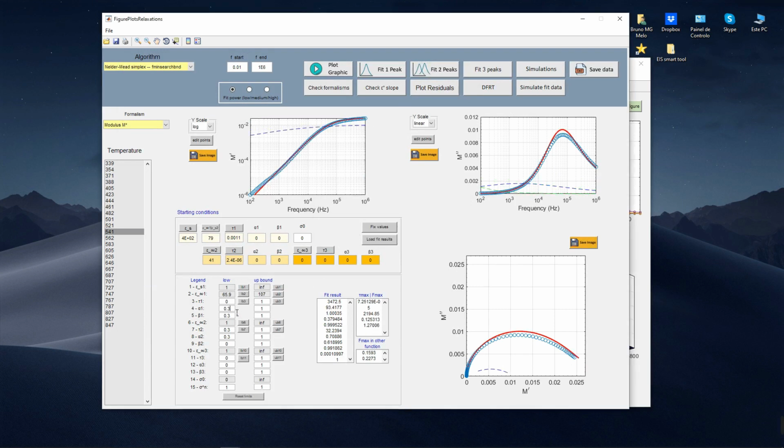Also not that very good. Let's increase this parameter, 0.4, 0.4. Here should be 0, and here 0.4, and here 4. Okay, this seems to start to be a little bit more reasonable.